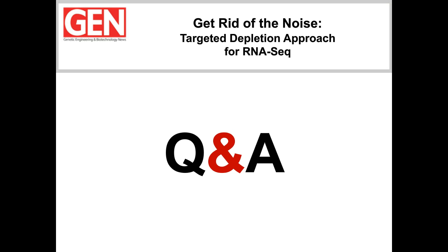Okay, great. Thanks, Maureen. Ashesh, another question for you. Someone asked, how do I generate a custom InDA-C probe set? That's a great question. I would recommend that whenever you would like to generate a custom probe set, contact our fantastic technical support team, and they can work with you to understand your project and exactly what you'd like to do, and discuss what is needed for us to generate the custom probe set. You can contact Nugent Tech Support by emailing techsupport@nugent.com, or you can call Nugent directly and get to the tech support helpline.